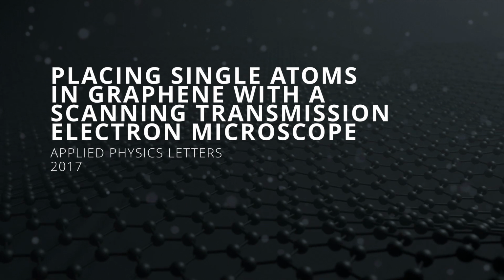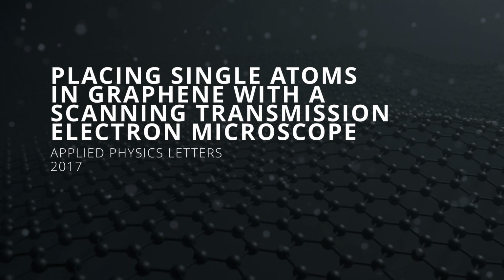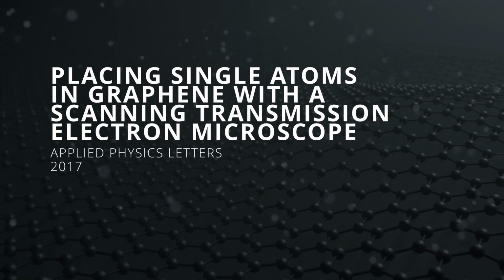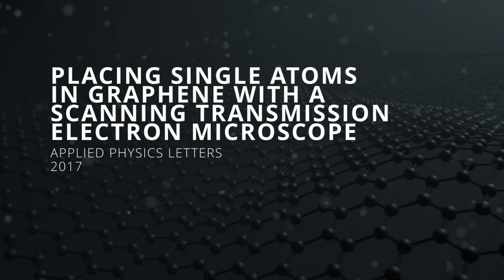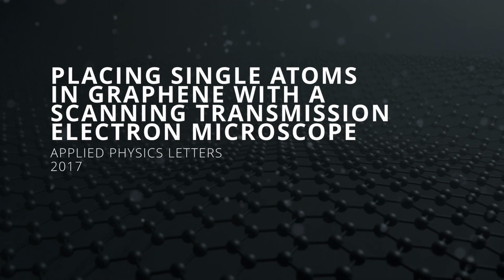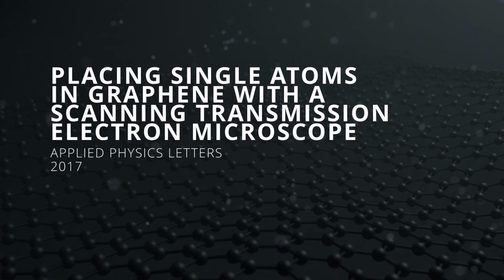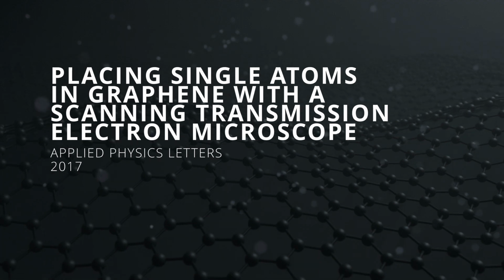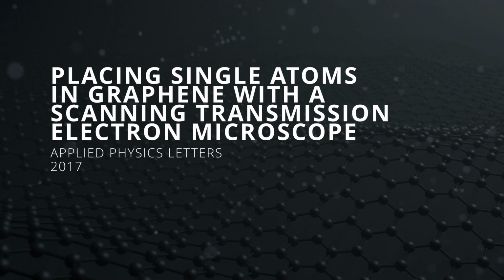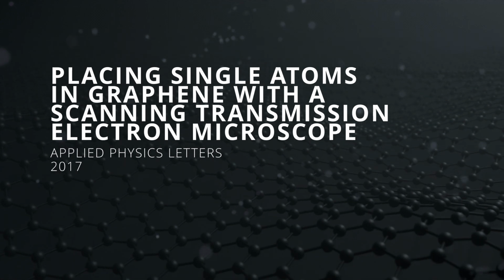Placing single atoms in graphene with a scanning transmission electron microscope. This paper was published in Applied Physics Letters in 2017. In it, we describe how single atoms can be introduced into suspended single-layer graphene using a focused electron beam. We also show how a threefold coordinated silicon dopant can be moved step by step through the graphene lattice, illustrating the atomically precise movement of a single atom.